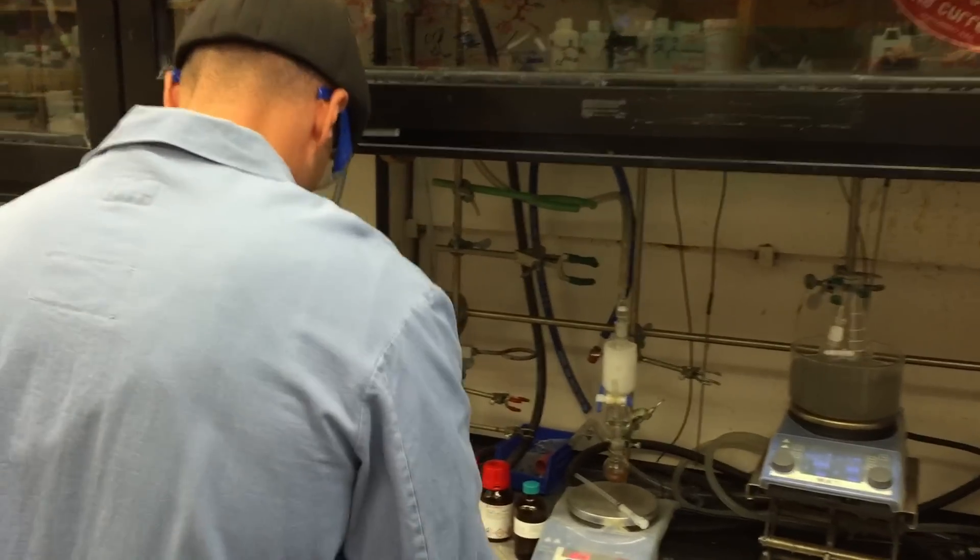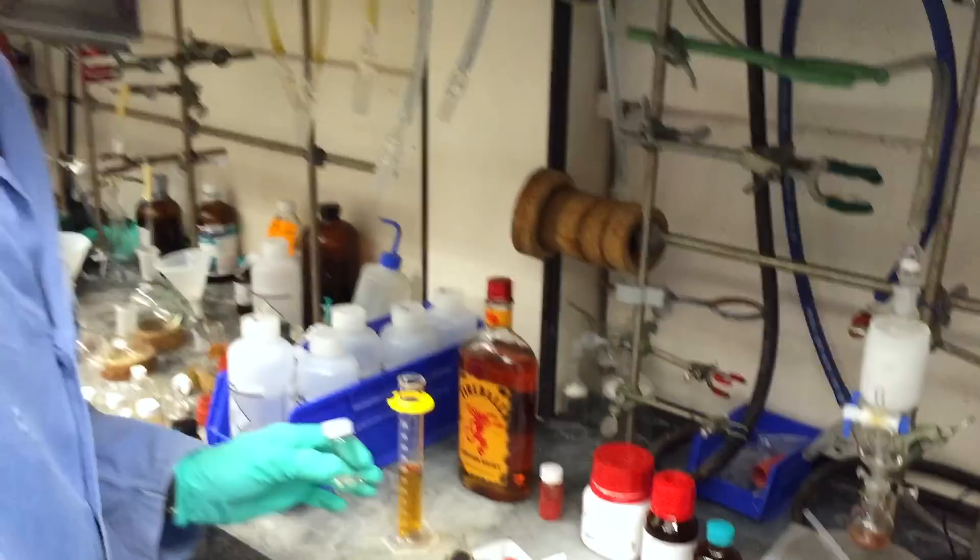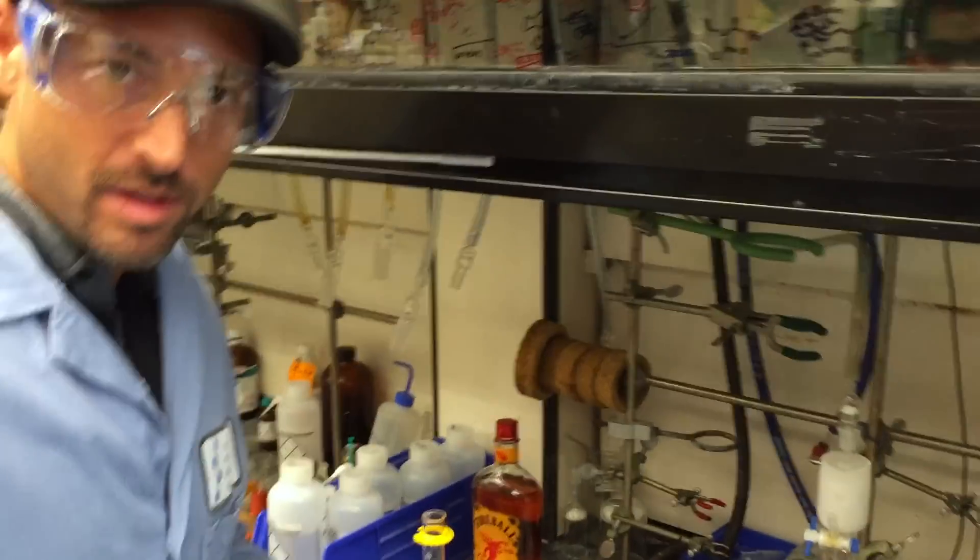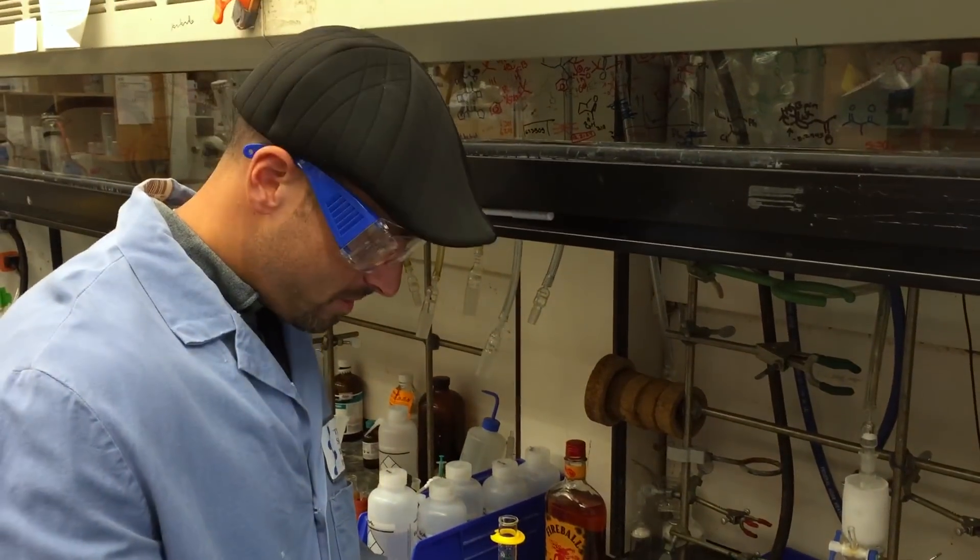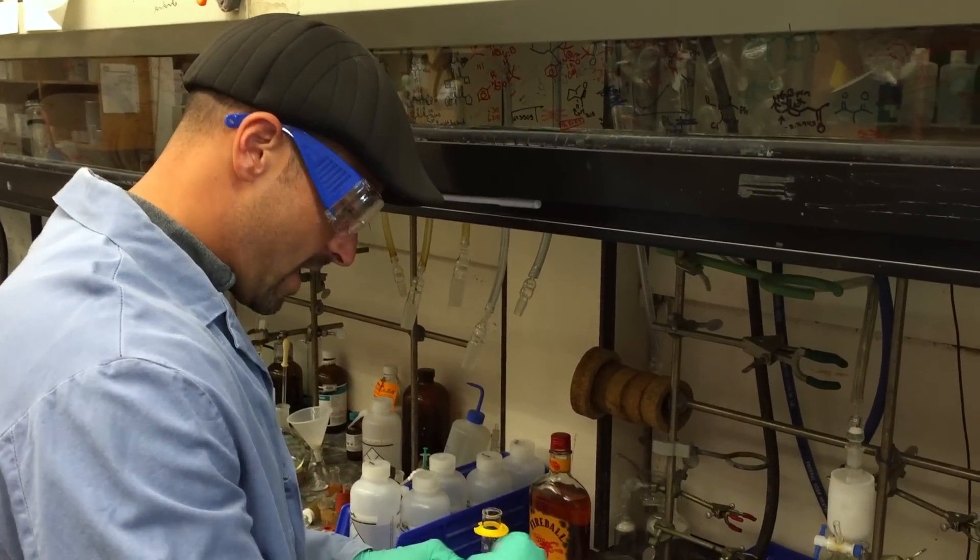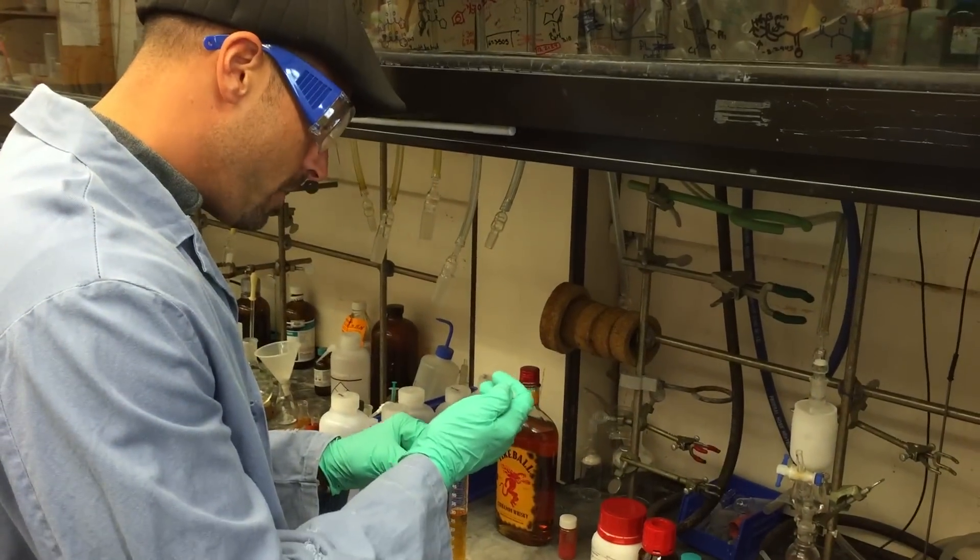So we need to measure out our substrate. And Julian is my sous chef, so he's done all the cutting and weighing out. So all I have to do is measure things out and add them to an Erlenmeyer flask.